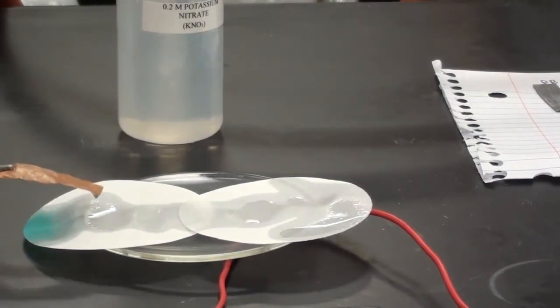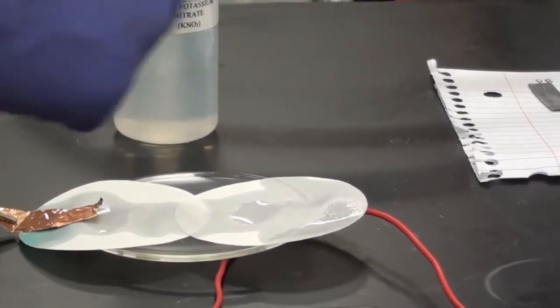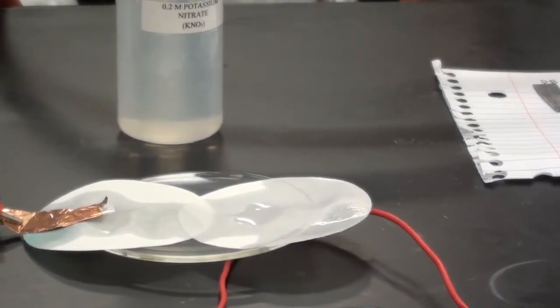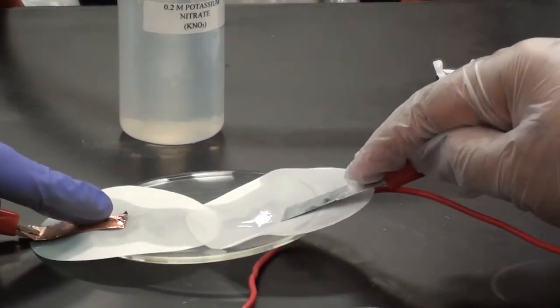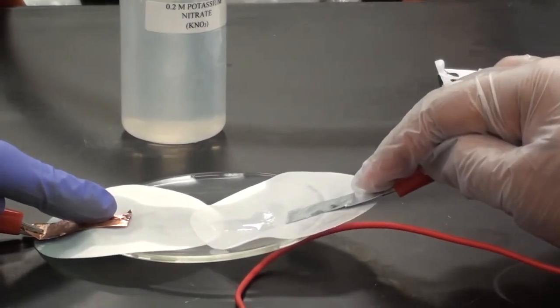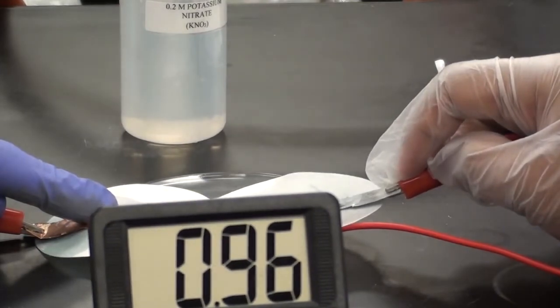Now what he's going to do is touch, Taylor, can we have your assistance please? Could you please touch the zinc to the zinc solution here? Ali, if you do, could you do it please? Could you touch the zinc to the zinc solution, zinc side? Here we go, that's right. And you can see, could you please move the multimeter up a bit? There we go. And you can see that's giving a reading now.